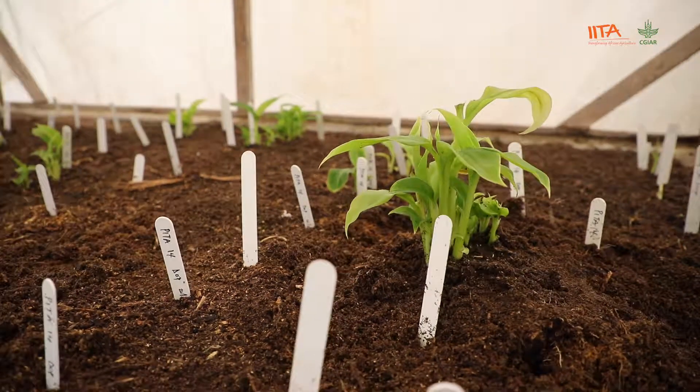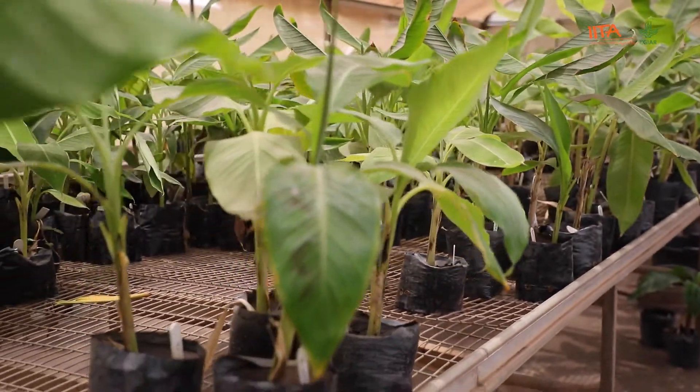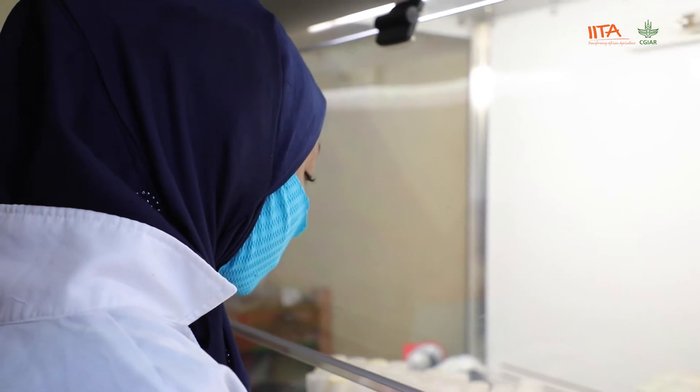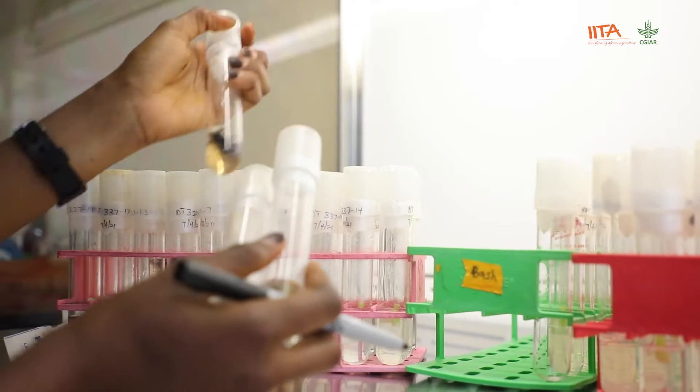Welcome to the plantain and banana breeding program at IITA. You are now in the tissue culture lab, which is used to support plantain breeding for food security. In the tissue culture lab, we use tissue culture techniques to germinate our seeds from crosses through what is called embryo germination or embryo rescue.